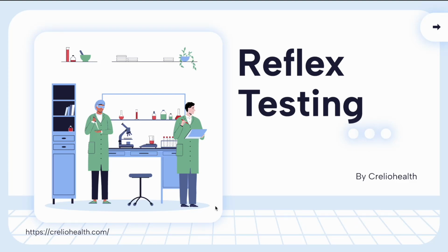Hi everyone, so today we'll see how reflex testing works in CrelioHealth LIMS. But before that, let's understand what reflex testing is. Reflex testing is an automated process where additional tests are ordered based on the results of an initial test.